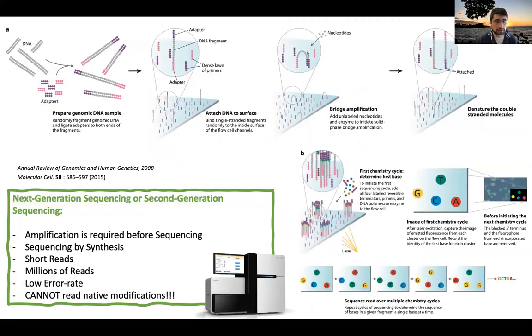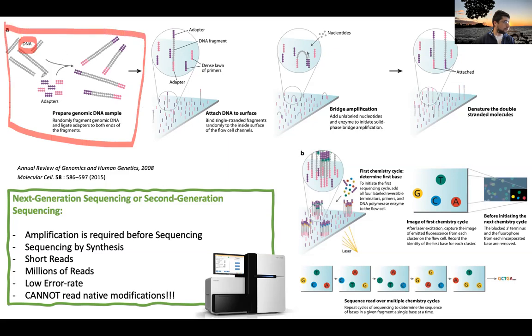Okay. All right. So let's go back to the Illumina technology, which is the technology that most of us are gonna end up using and the leader on the market right now. How the Illumina technology works is basically you have your input DNA, and what we're gonna see today is this part right here: how to prepare a library for sequencing, okay? I'm not gonna talk too much about this right now, but you can basically see that you are adding pink and purple pieces of DNA next to your DNA fragments. And then you load the mixture of these modified DNA fragments into the sequencing machine.